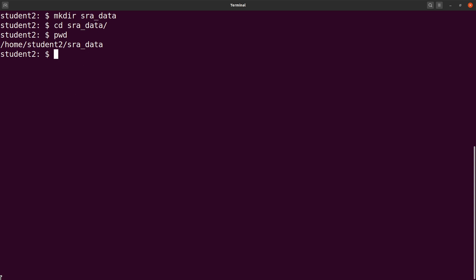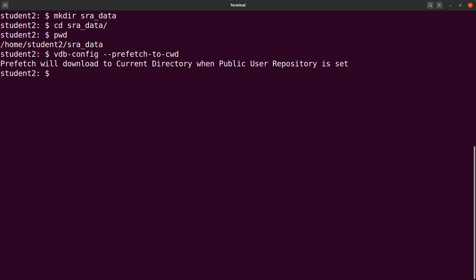I want all files downloaded to be saved here, so I'll use the vdb-config. So I say vdb-config and then I add this option, --prefetch-to-cwd. Then I set my current working directory as where files should be saved.